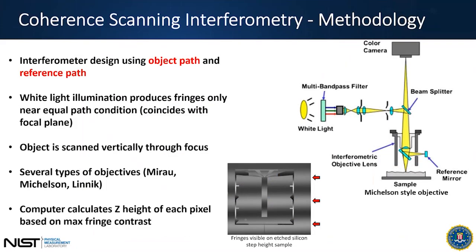Well, the microscopes are set up in a way that you have a reference mirror. This reference mirror is at the current focal plane of your objective. So the light as it comes through is split between the reference and the sample. And if the sample is sitting at the current focal plane, then you should get constructive interference, meaning your signal gets higher.